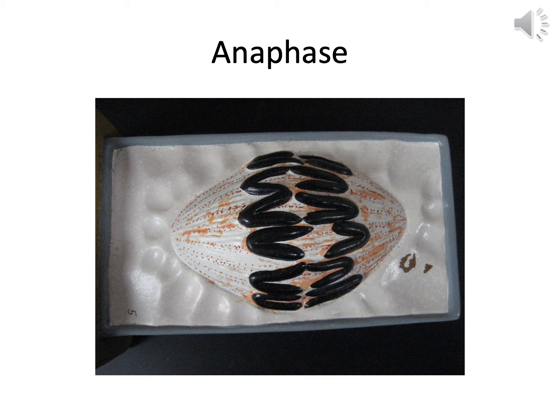During anaphase of plants, we'll be pulling the chromosomes apart, just like we did in anaphase with animals. As long as you can see a little bit of space between the black chromosomes, we're going to call it anaphase. The centromeres split and separate, the daughter chromosomes move by the aid of spindle fibers to opposite poles of the cell, and you have a little bit of space as the chromosomes are pulled apart. A is for anaphase, A is for apart.